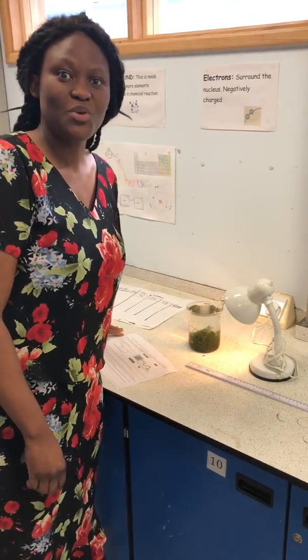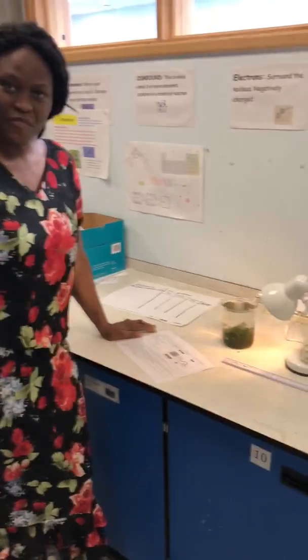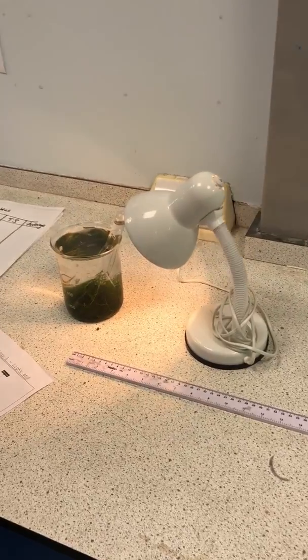Okay, so welcome to another Gable Hall practical. This time we're looking at photosynthesis. We're investigating the effect of light on the rate of photosynthesis.